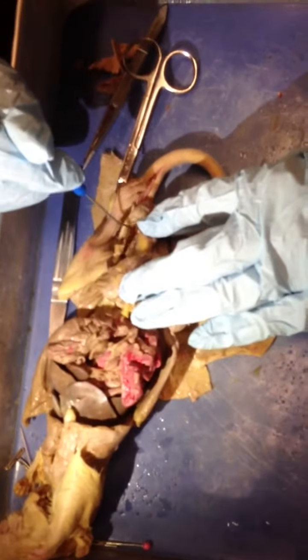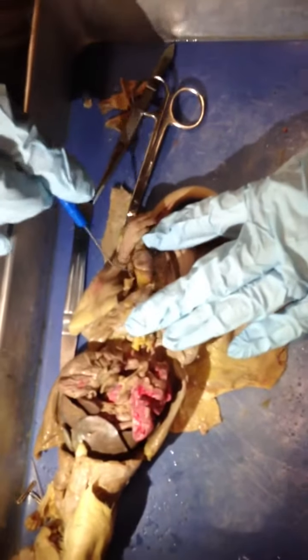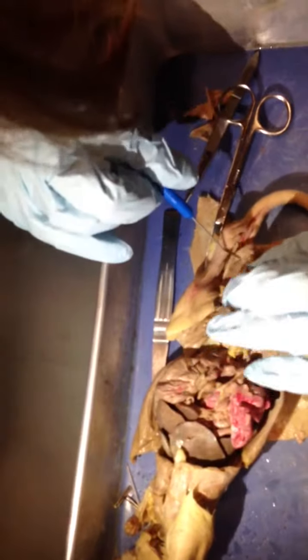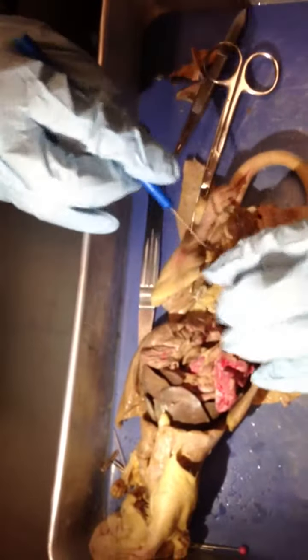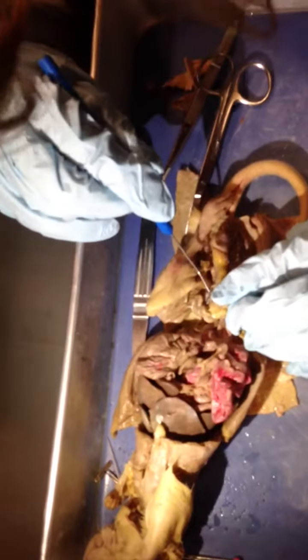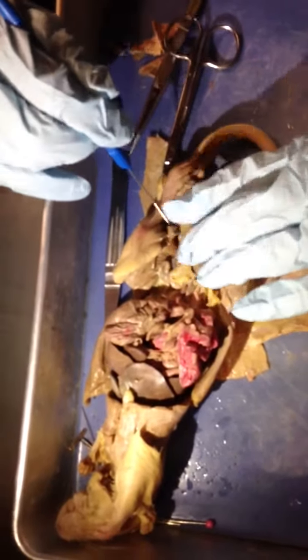Right here is a specialized mesentery, which we call mesorchium. And then at the very end, where the tail of the epididymis is, right here is like this thickened region. Hold on, I can pull it out a little. This thickened region right here, that's your gubernaculum. Okay. And then if you guys see this intertwined blue and red, that's your pampiniform plexus.